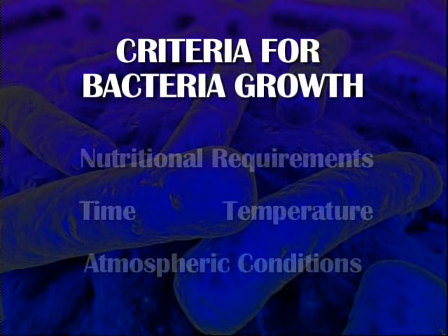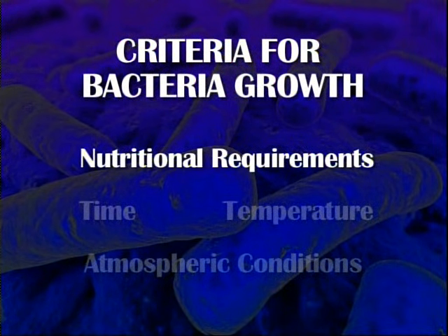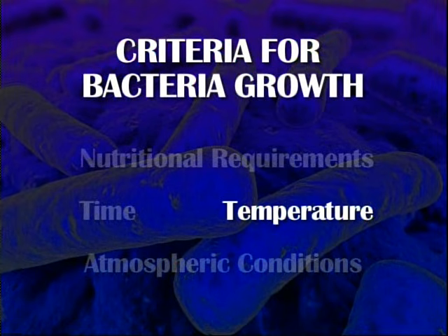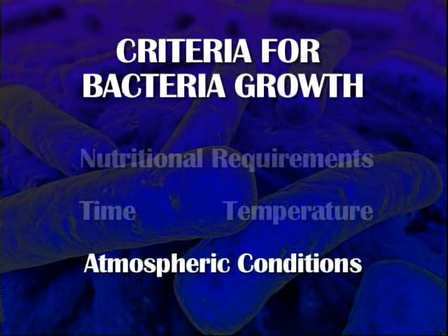In order to grow bacteria, there are four criteria that we have to look out for or take care of. One is the nutritional requirements of bacteria. The second is the time requirement for growth. The third is the temperature requirement. And the fourth is the atmospheric requirement.